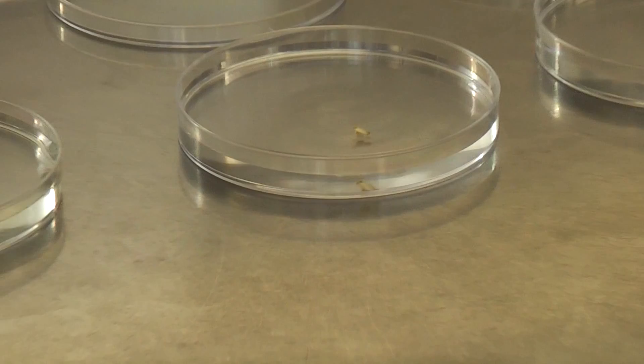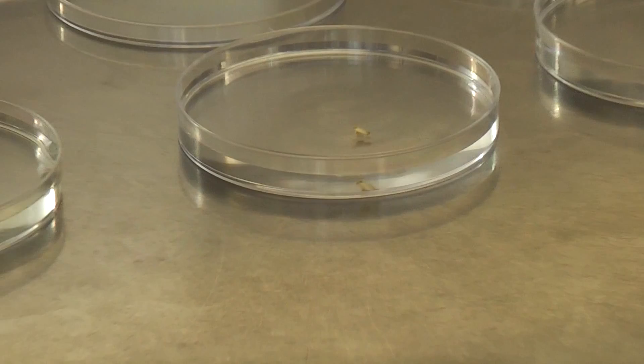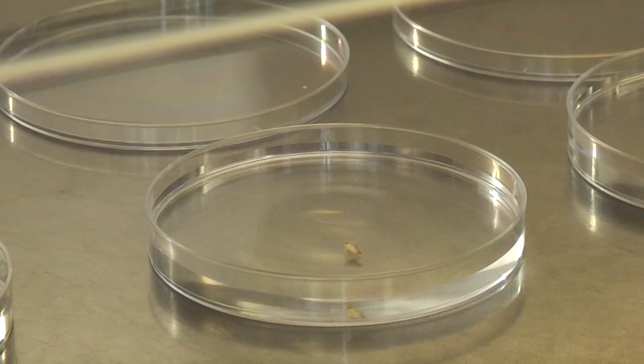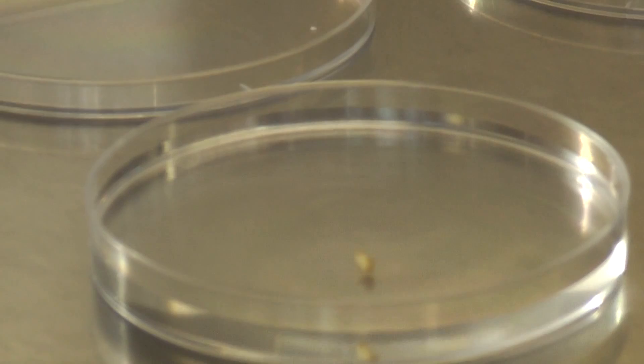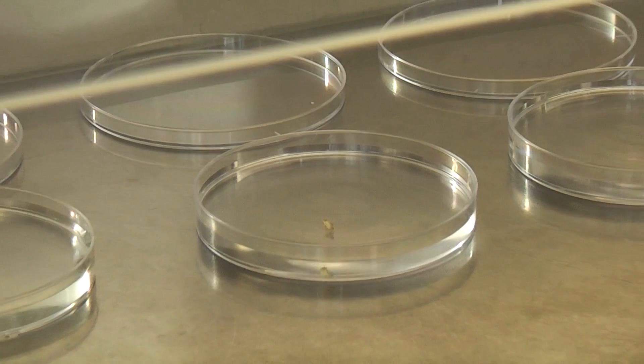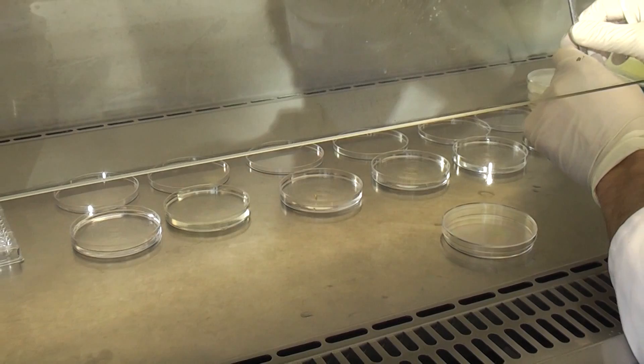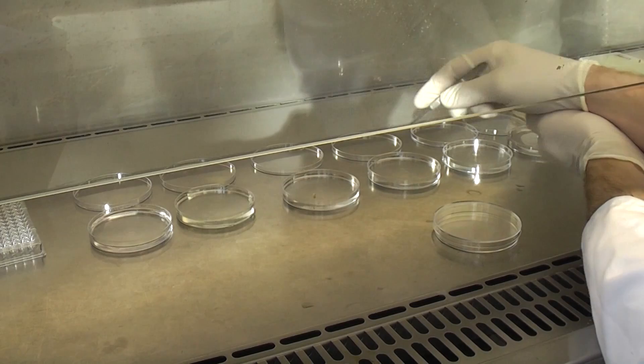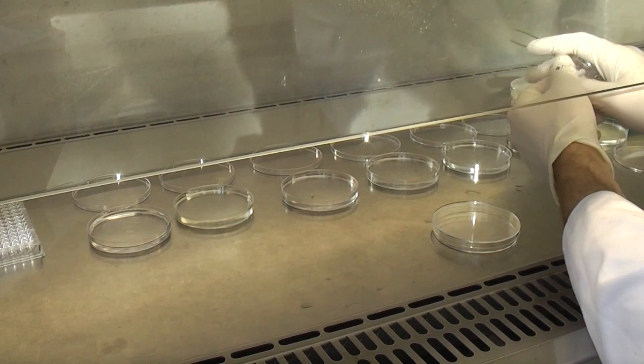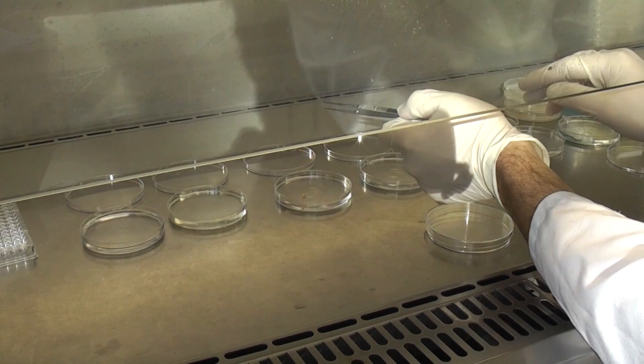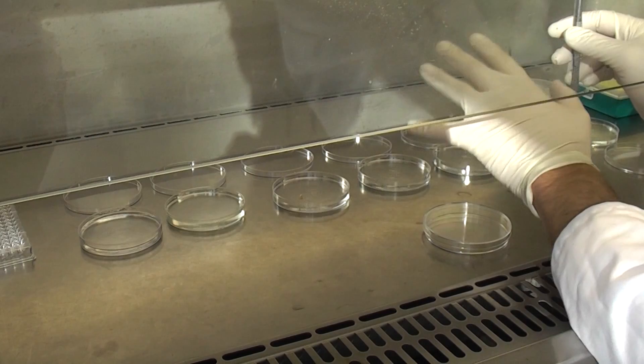So I didn't explain too thoroughly what this experiment was actually looking at at the start. Basically earlier last year I had gone around a whole lot of different sites of the South Island and collected wild plants from different populations of lupine, perennial lupine that is. So the ones you see on the roadside when you drive through Mackenzie Basin and Arthur's Pass and things like that, the colorful flower. And we isolated a whole lot of different rhizobia which are the nitrogen fixing bacteria present in most legumes. We isolated the rhizobia, identified them, looked at their DNA makeup basically, looked at a few of their genes, mainly the nitrogen fixation and nodulation genes.